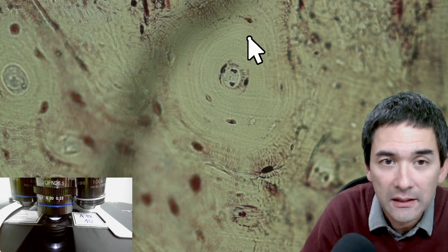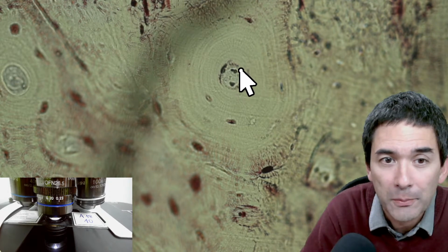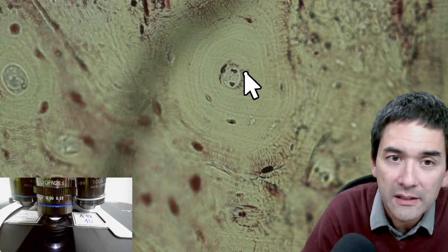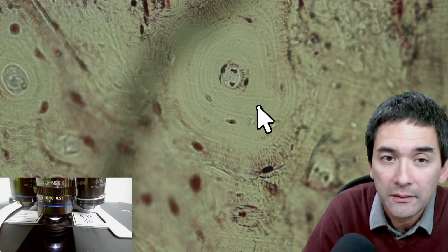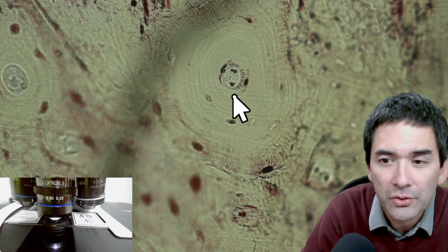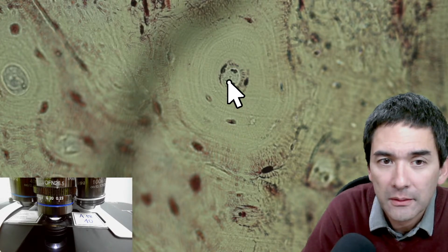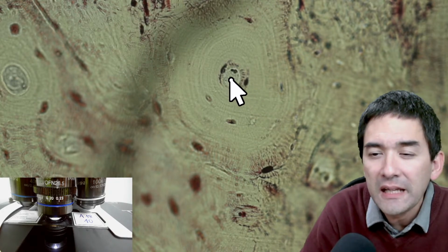So there are cells in bone, and this is the so-called Haversian canal, and this is where blood is transported. So there are blood vessels inside the bone, and there are also bone cells, and you can also see the rings that you see here, these are called lamellae. What you cannot see so well here, it's very fine, a little bit better over here, there are also certain canals which transport the blood like this outwards. Do you know staining techniques used?